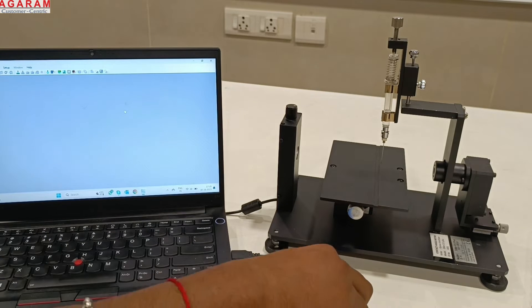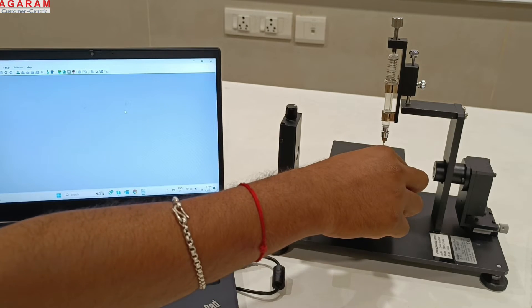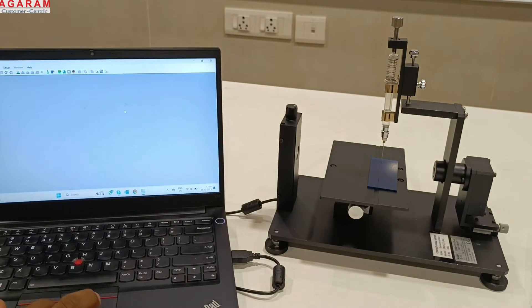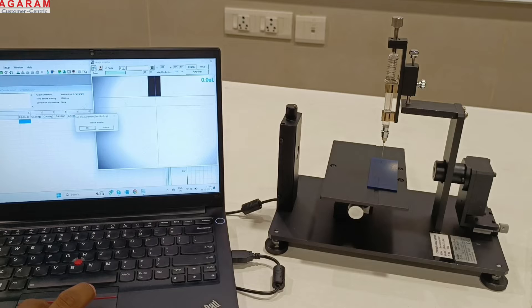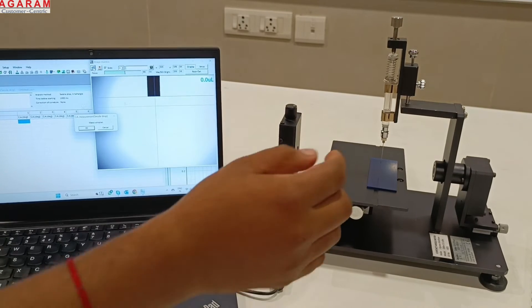Performing measurements on contact angle meter is simple. Place your sample on the stage and fill the syringe with the desired liquid that has to be deposited.